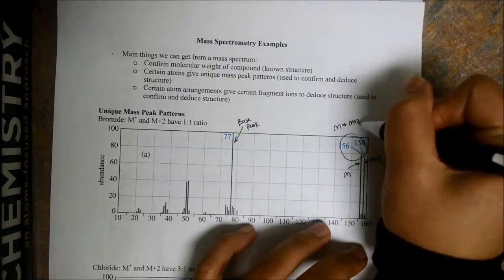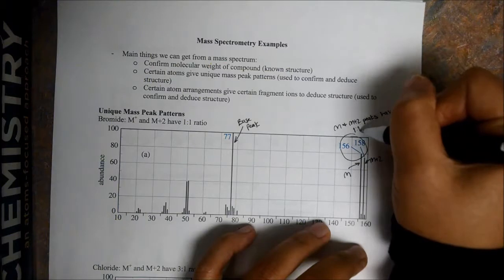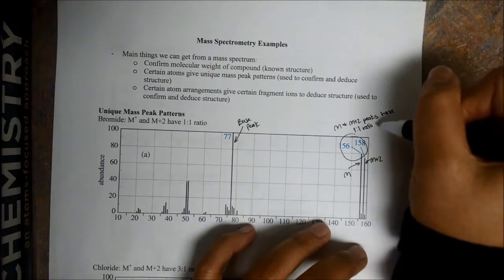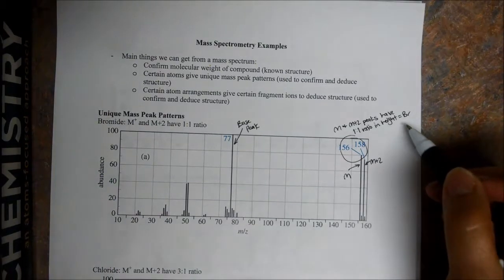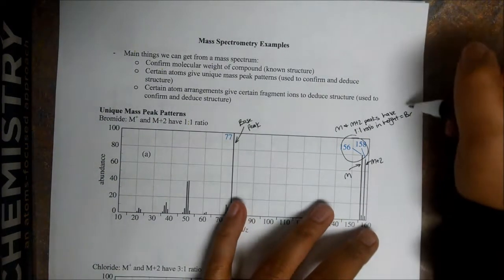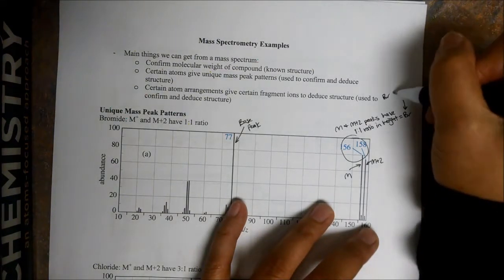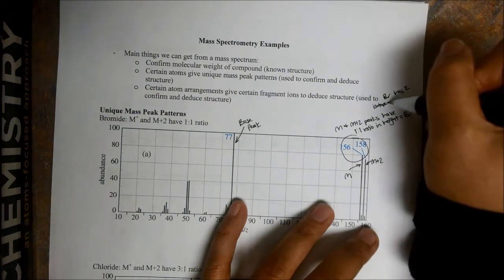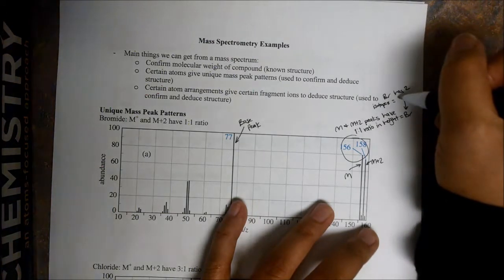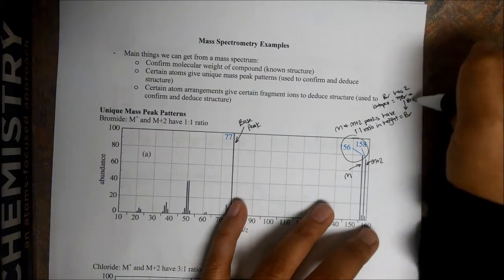M and M plus 2 peaks have a 1-to-1 ratio in height. And again, this is indicative of a bromine. Does anybody know possibly why? It's kind of hard because you guys haven't seen this before. But this is because bromine is present in 2 isotopes. Okay? Bromine has 2 isotopes. There is bromine 79 and bromine 81.